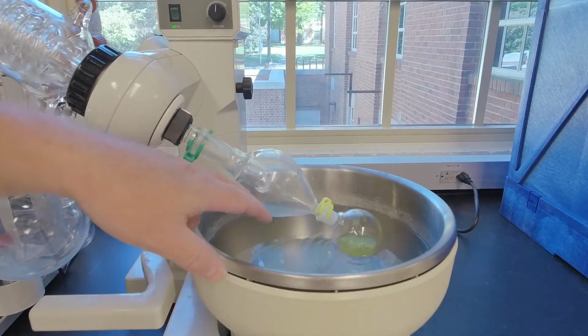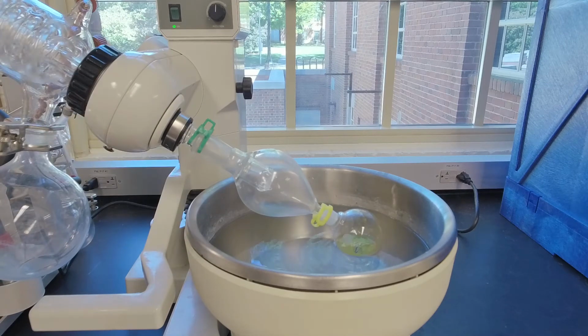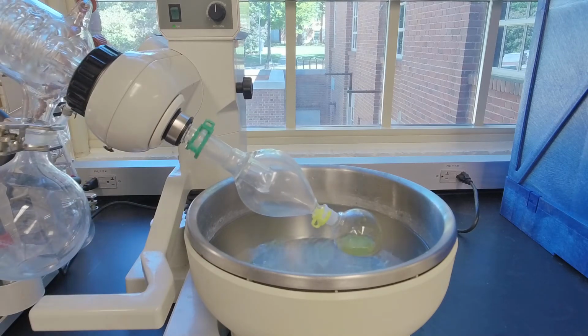This bump trap, imagine that we heat it up too much. Say we have something that boils, like dichloromethane, like you guys are going to use in the lab. Well, when I'm filming this in September of 2021, the lab I'm filming it for, we're going to rotovap dichloromethane. Again, you can rotovap anything. All right, this is ethyl acetate. It boils a good bit higher than dichloromethane, so it's boiling smoothly.